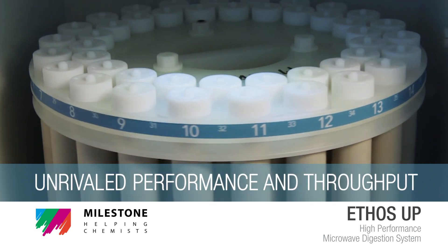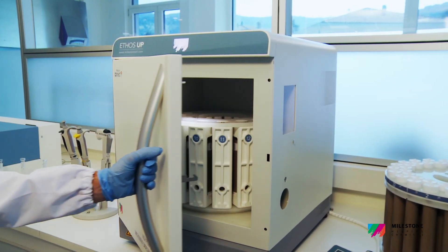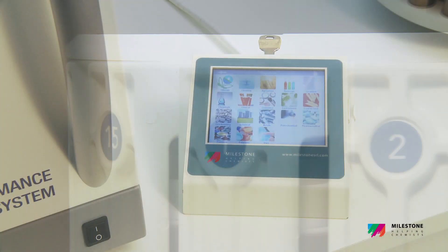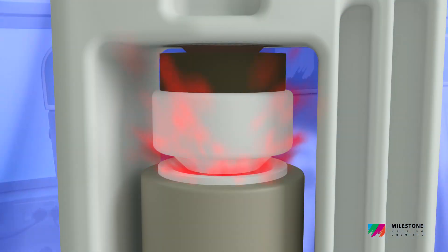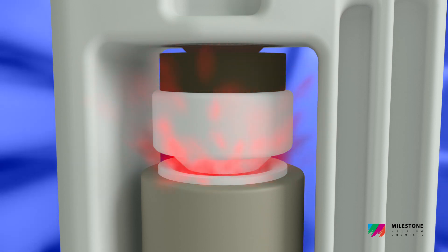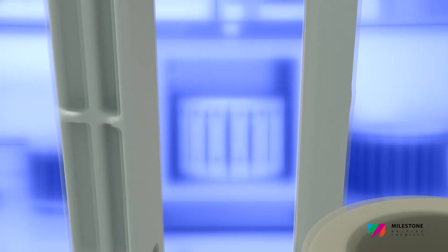Unrivaled Performance and Throughput. No matter what sample you are trying to digest, the Milestone SK-15 rotor is always an effective option to simplify the journey from sample to analysis, even for the hard-to-digest samples. Safety is assured by our unique vent and reseal technology, which is the foundation of Milestone's position as the leader in the closed-vessel microwave digestion sector.